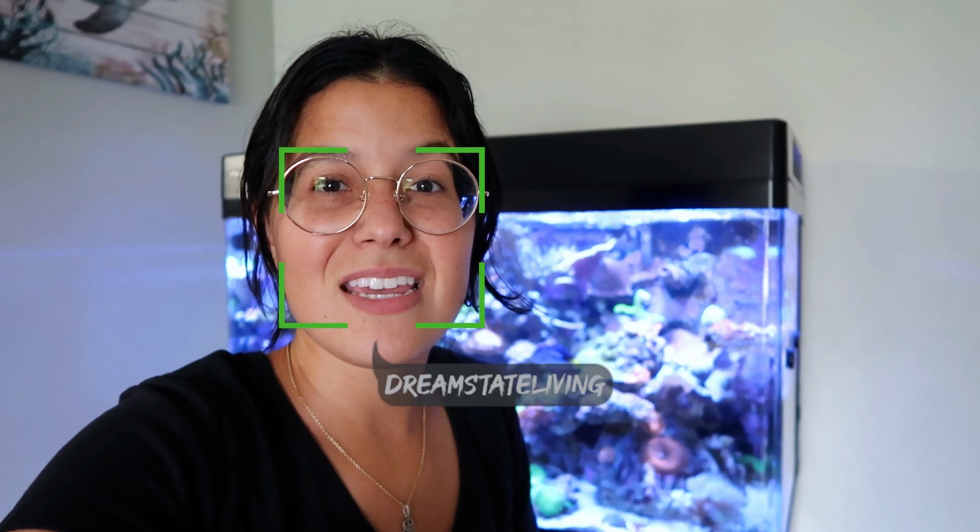Come say what's up. It's been a while since I've done an ATI test. You know, the ones where you order it in, they give you test vials, and you ship them out, and then they test the full workup on your water and give you the results, so you can see what trace elements you might be low in, or what's going on in the water column. So it's been over a year since I've done that, and I started noticing some things happening in my tank, and I figured, well, why not just do the test again and see if my suspicions are correct.